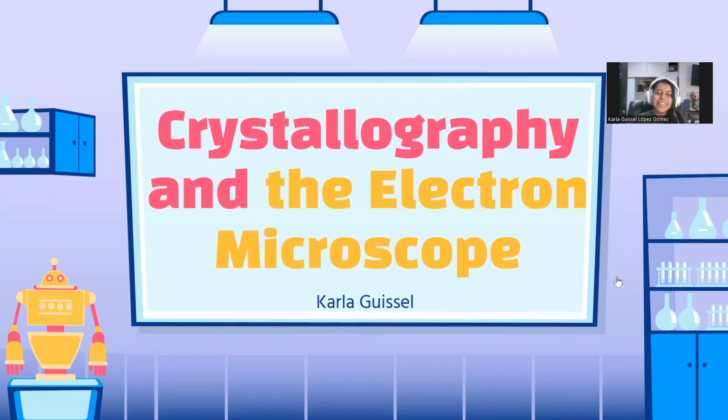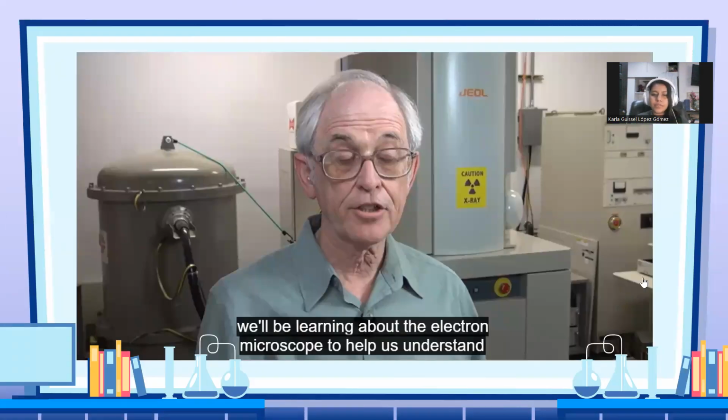that I get it. So in the video, we will be learning about the electron microscope to help us understand the atomic structure of materials. They focused on the aluminum structure to make it easier and to stay with one material. If you want to understand other materials, you only have to see the structure. This was just a general example to understand other examples in the future, because they're going to teach us about other materials, but they're going to focus more on aluminum.